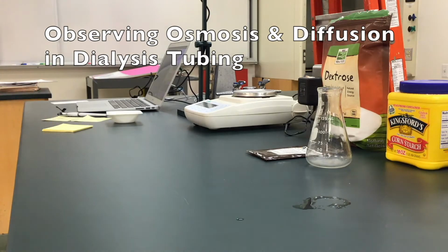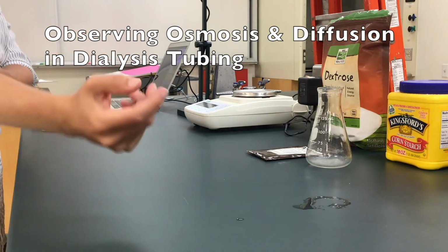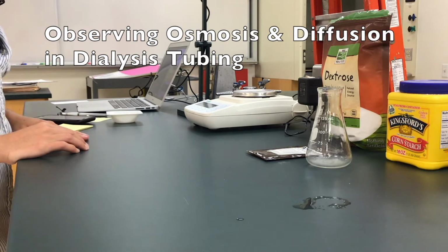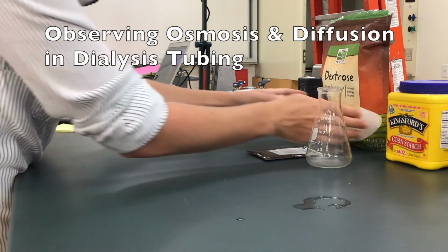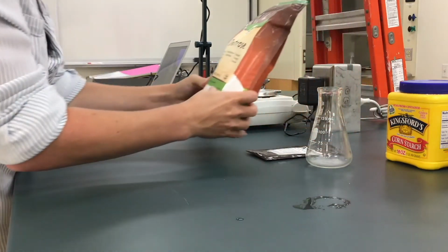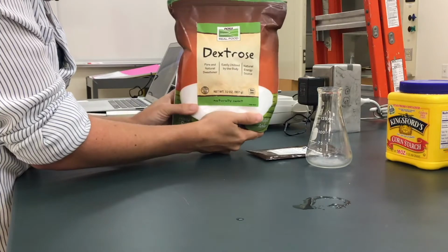So first we're going to prepare our solution that goes in our dialysis tubing. So we're going to start with dextrose.